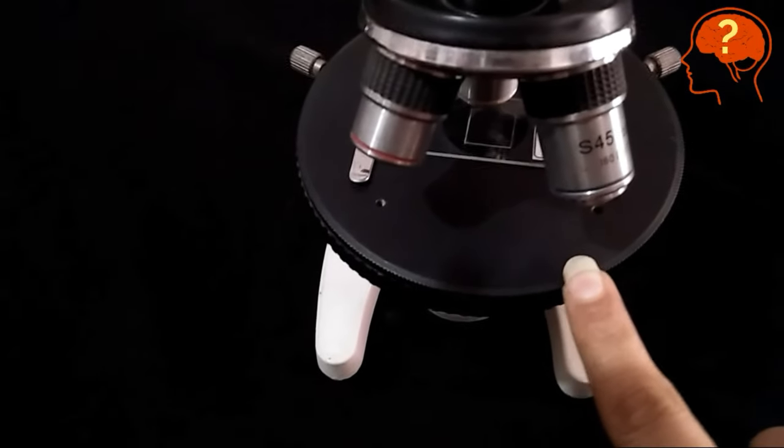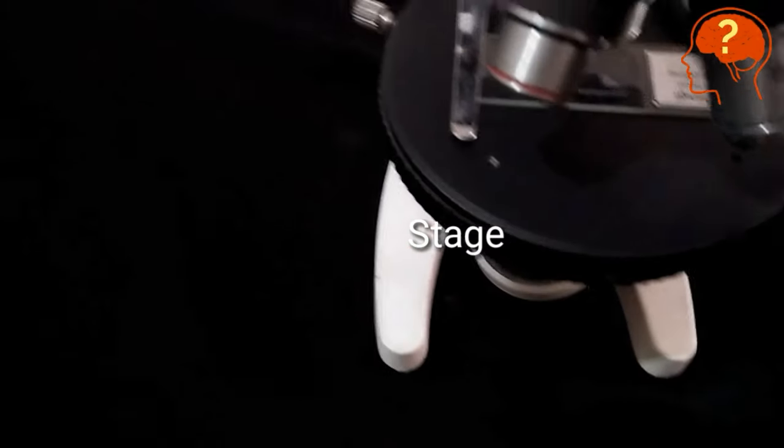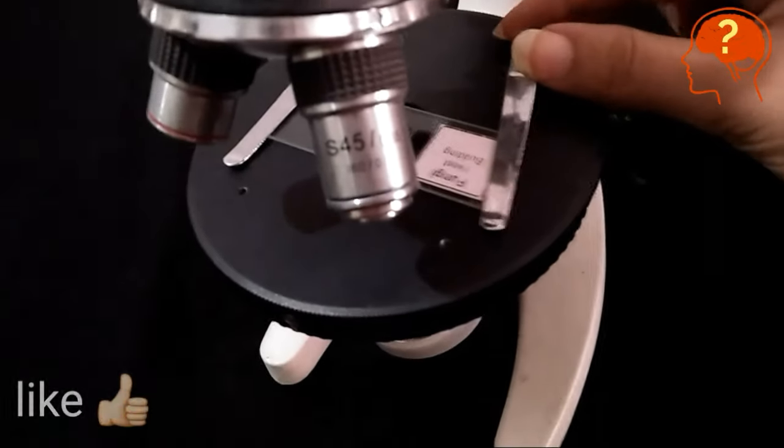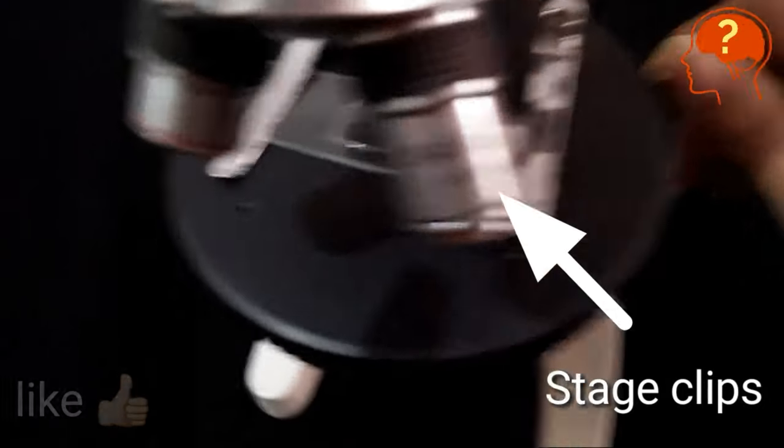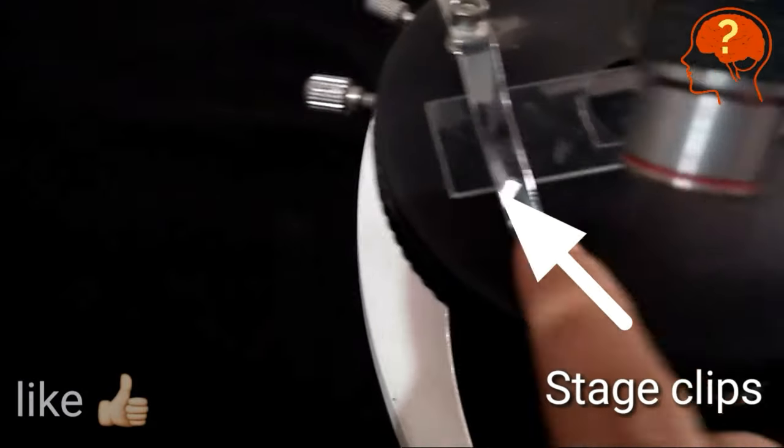This structure is called the stage where you will place the slide. Now you will adjust the slide with the help of these two stage clips. They help to move the slide.